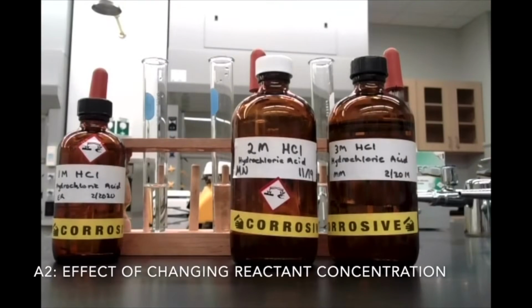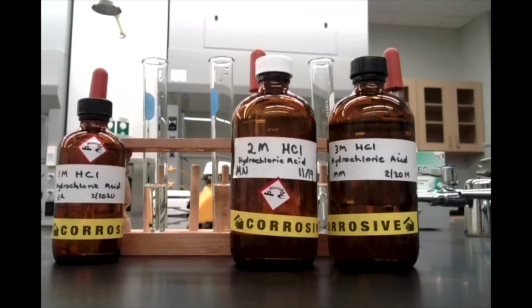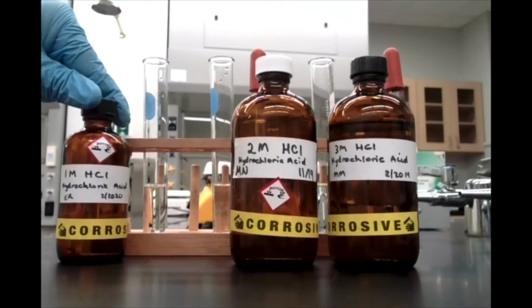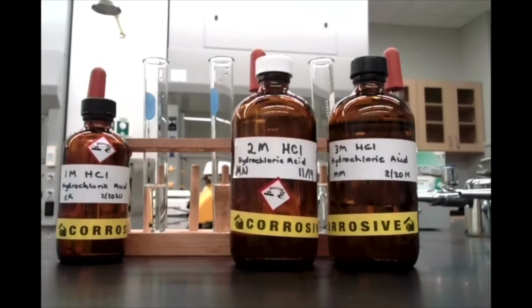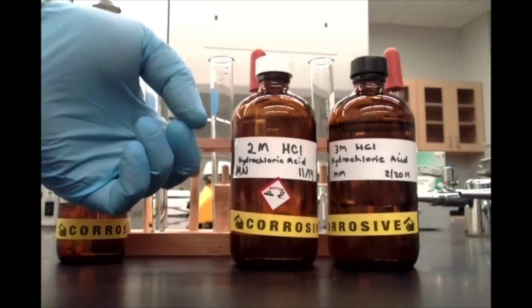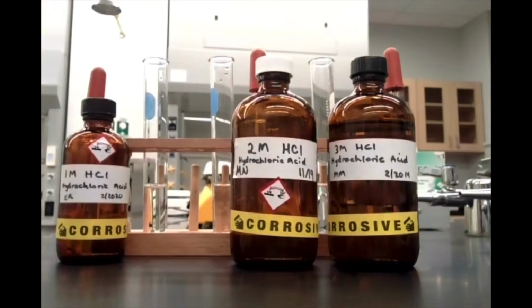Alright, here we have 3 test tubes of hydrochloric acid, each with 10 milliliters, but the difference between them is the concentration of the hydrochloric acid. In our test tube on the left here, we have 1 molar hydrochloric acid. That means that for every liter of this solution, there's 1 mole of HCl dissolved in there. In our second test tube, we have 2 molar HCl, so double that concentration. And in our third test tube, we have 3 molar HCl, triple that concentration of our first one.